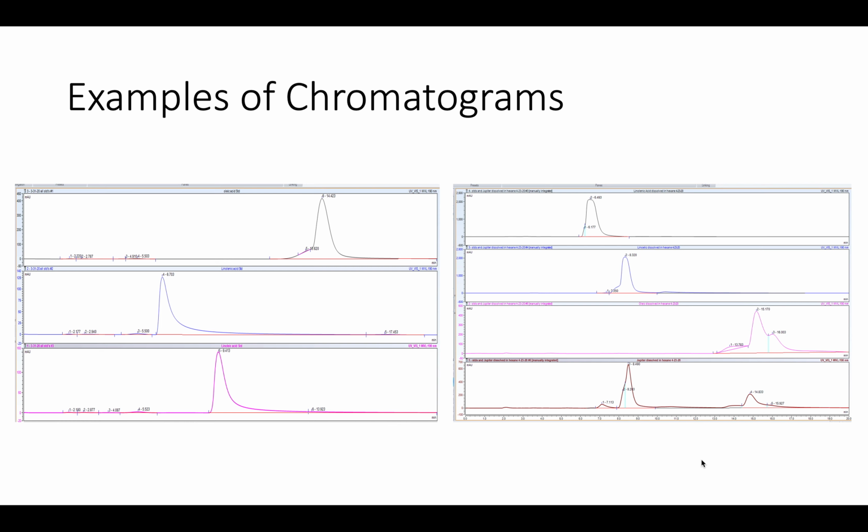The second chromatogram shows our standards and one sample of rice bran oil dissolved in hexane, and hexane is a nonpolar solvent. This solvent did not give us quite as nice of peaks as you can see by looking at these chromatograms, but it did give us a better retention time for our sample so that we could easily compare the peaks of our sample to the peaks of our standards.